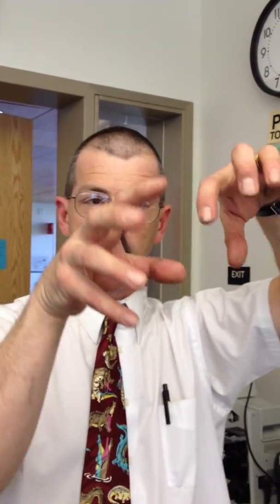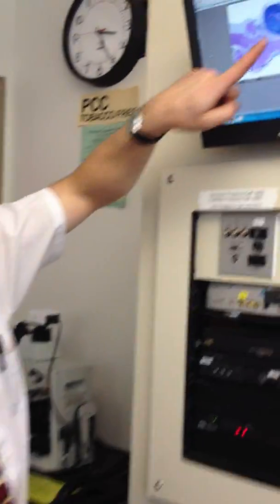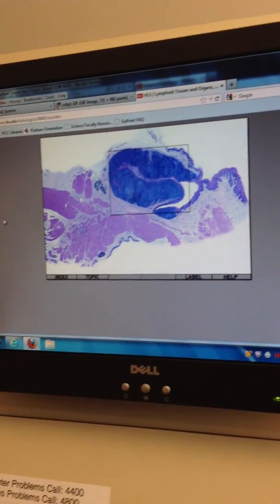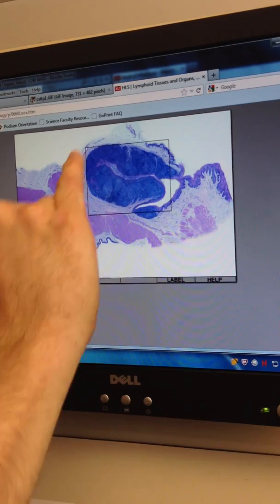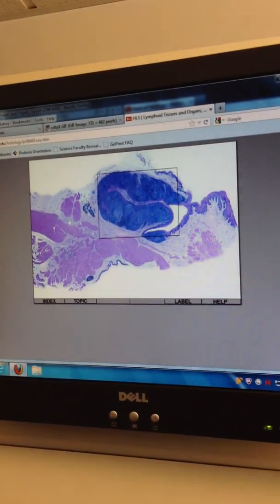The thing about tonsil, what makes it unique, is it's like a lymph node that's been folded in half, so it makes a U kind of thing. So it's probably got that hilum. It kind of would look like a hilum, but it's actually called a crypt in a tonsil. But you take a lymph node and you just kind of bend it, so you have these cortexes that go like that. There we go. So you can see the rings being lymphoid, but instead of being a nice, typical thing, you have this big hole because you bent it. That's the crypt.